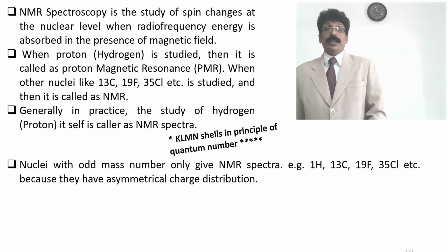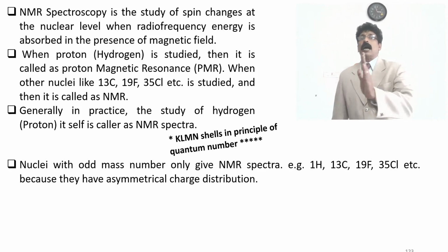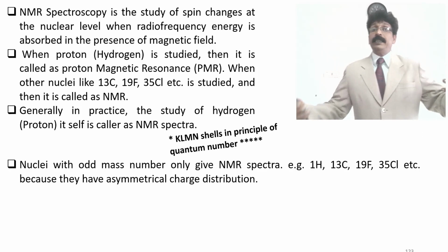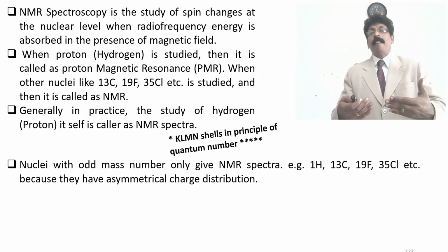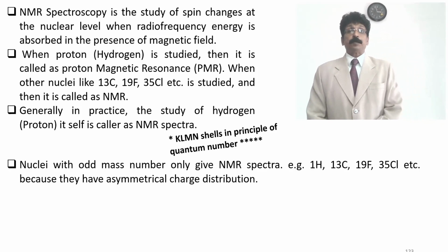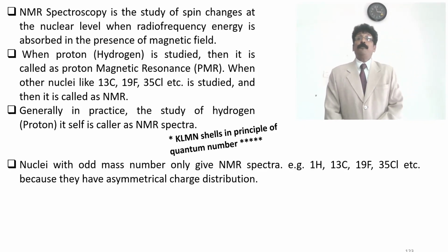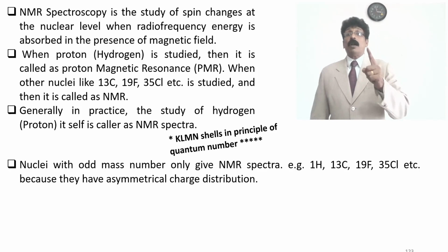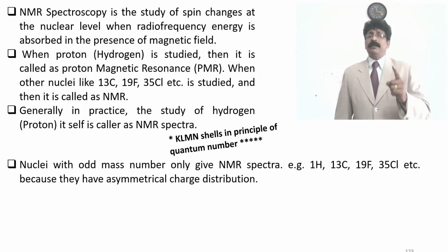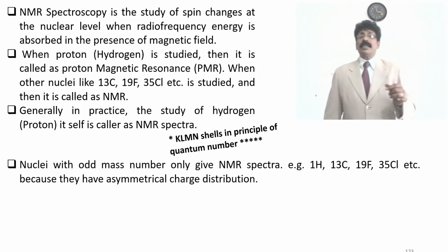All of these can give NMR spectra, and the interpretation can be obtained with the computer graph, because they have asymmetric charge distribution.